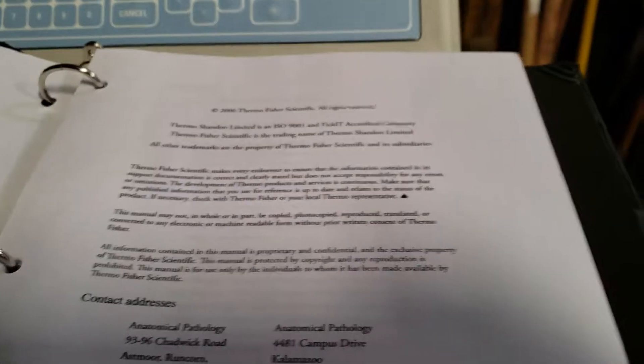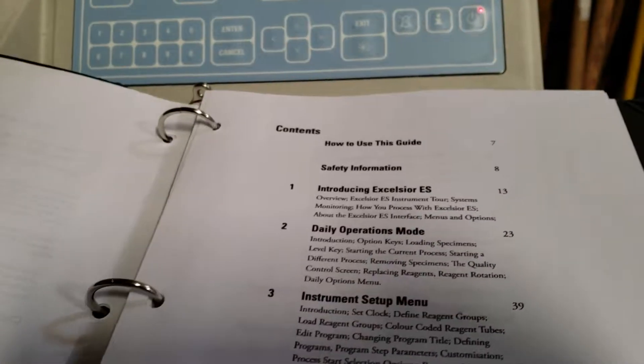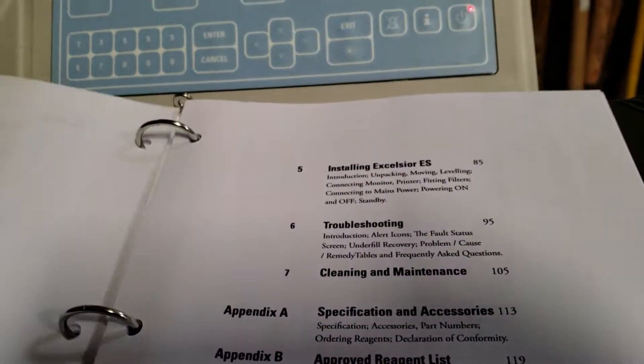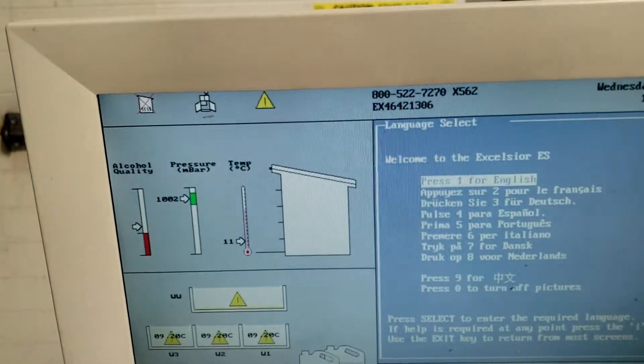Here's the factory manual that gives you a step-by-step guide.